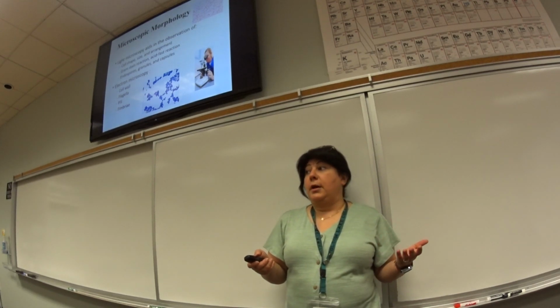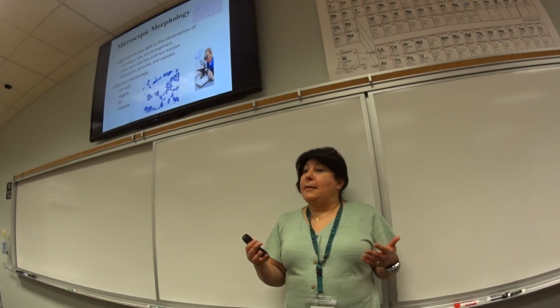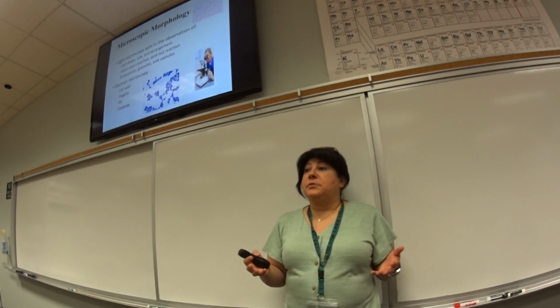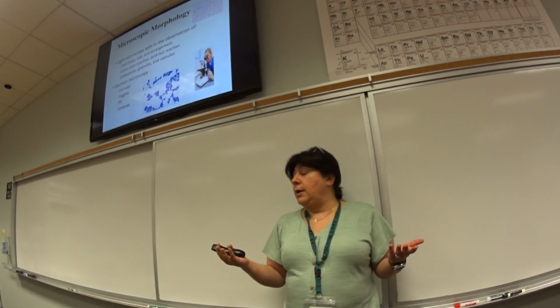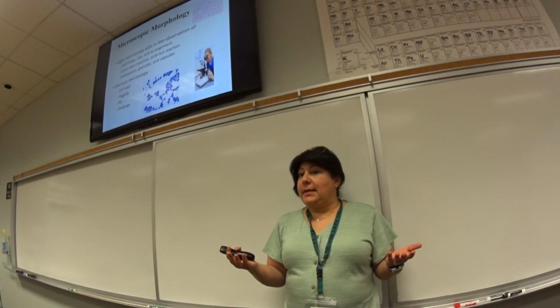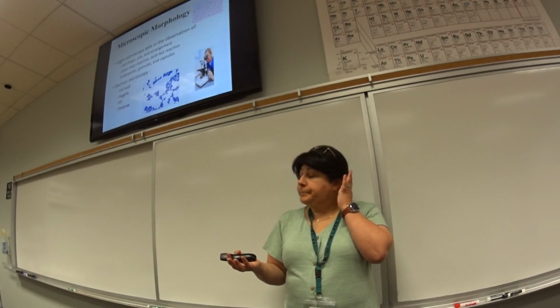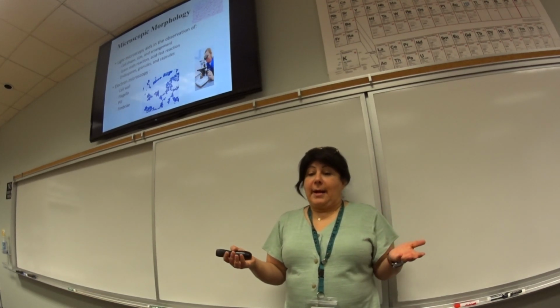Is it a rod, bacilli, or is it a cocci? Like I said, in this lab, we never look at any spirillum. So it's either cocci or rod. It's gram positive or gram negative. We did not work with acid fast, so you would not expect to see acid fast. So gram positive, gram negative.